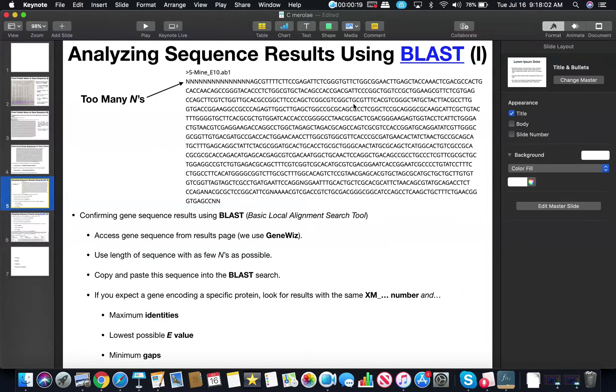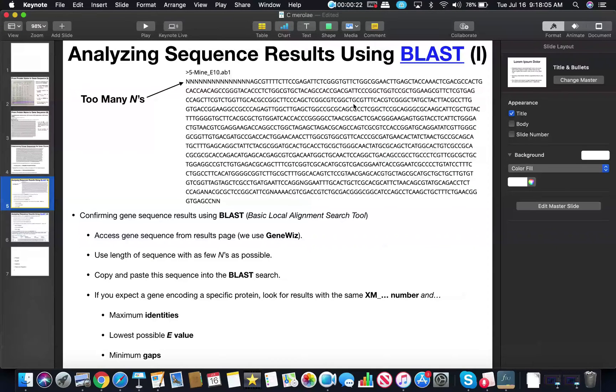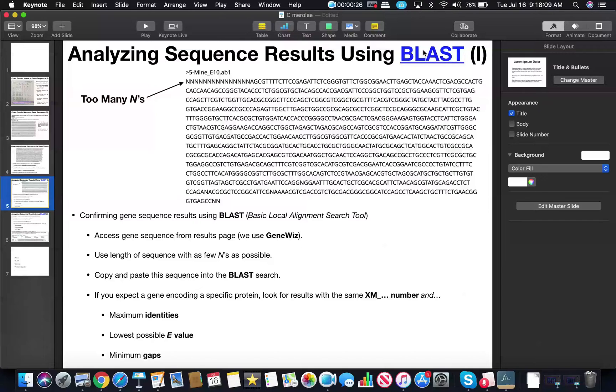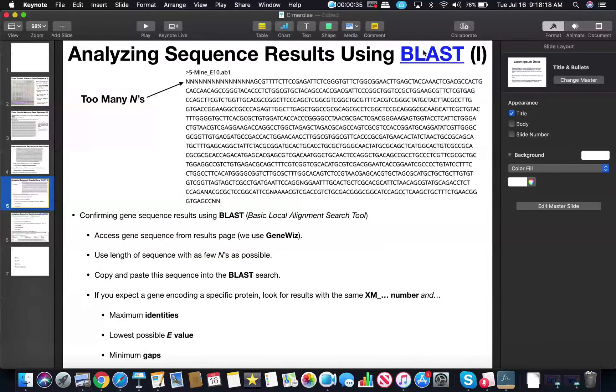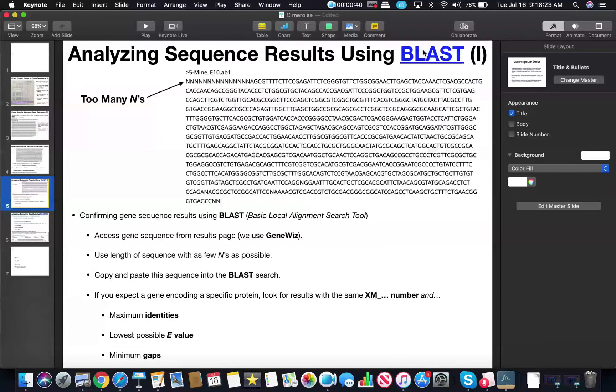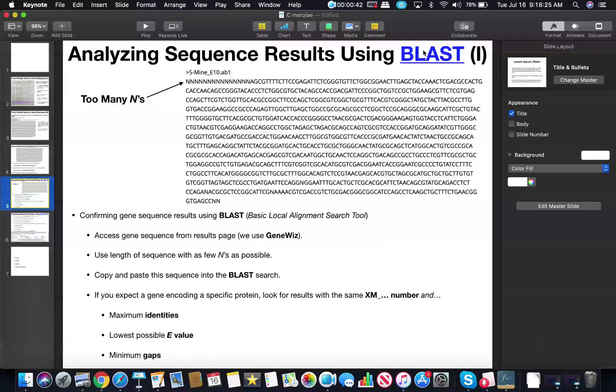In this video I'm going to show you how to analyze your gene sequence results using this program called BLAST. BLAST allows you to insert a sequence of nucleotides that you've obtained through a sequencing reaction and then it will compare it through an entire database of known genes and it will allow you to identify the gene, both which protein it encodes or RNA, and which species it came from.